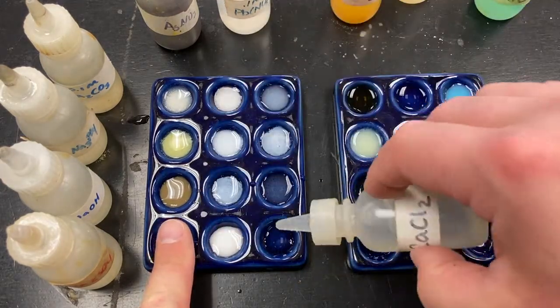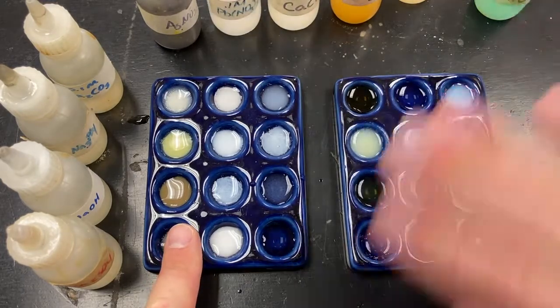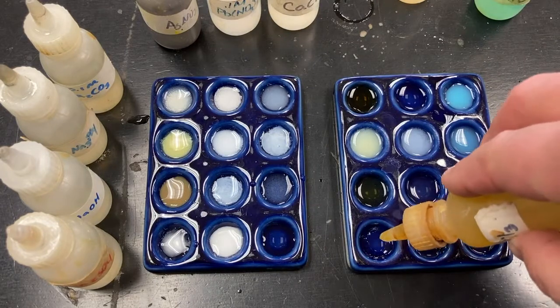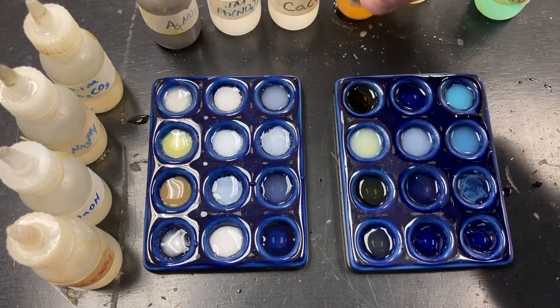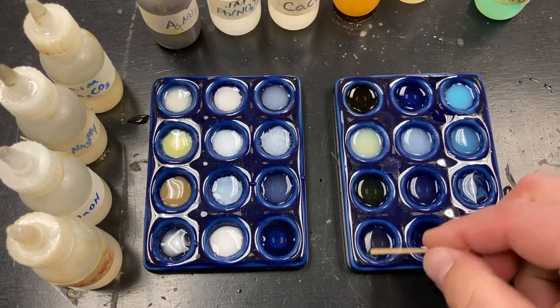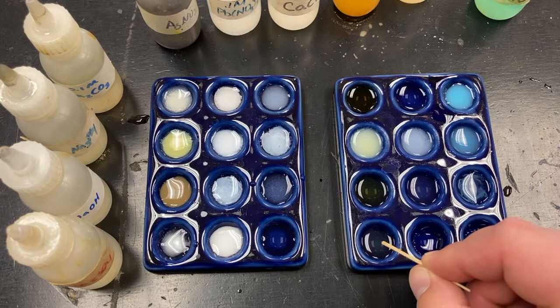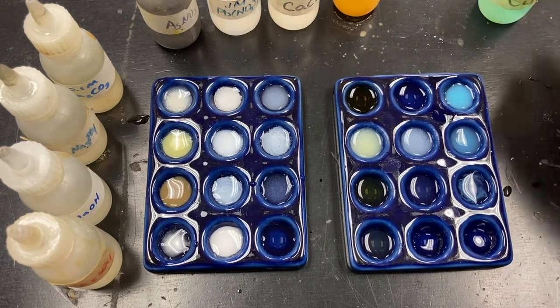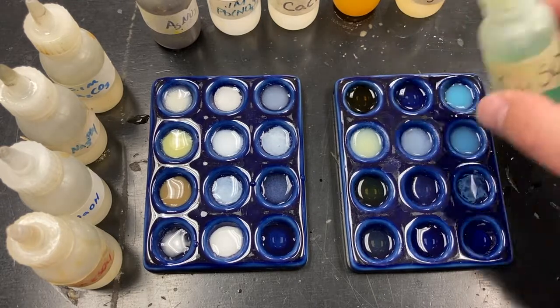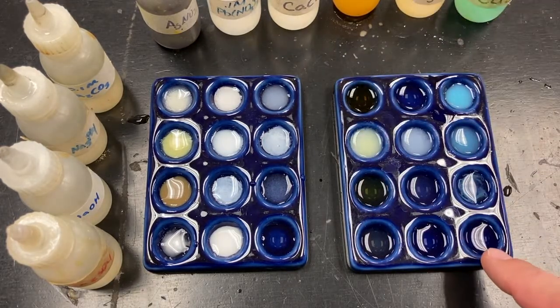Calcium chloride. Nothing. Iron chloride. A very faint, hard to see the color in the blue background, so we'll have to come back to that one a little later, but there's a very faint solid in there. And then magnesium sulfate. I don't see anything there. And then copper sulfate. I don't see anything there.